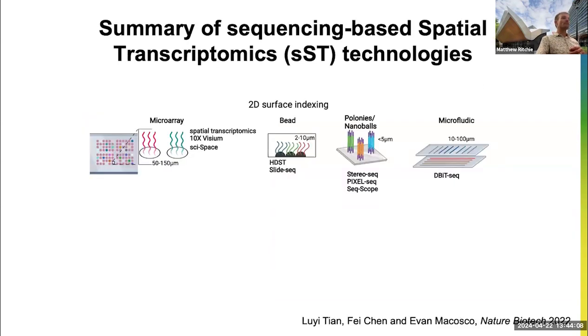So I did my PhD on microarray. We're back here. Microarrays are still useful, and now they're useful for probing spatial transcriptomics. For example, we've got a range of different ways of profiling that are listed on this slide. Microarray is one of them, a popular one. 10x Visium uses this approach. And of course, you've got spots of different sizes.